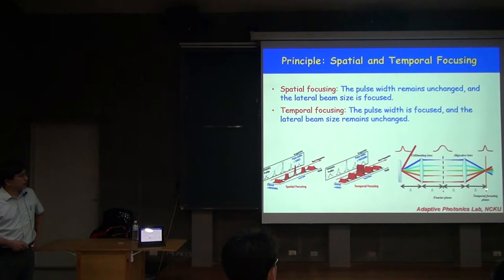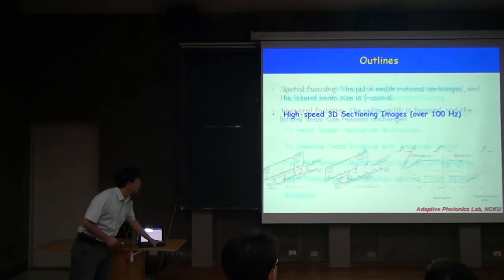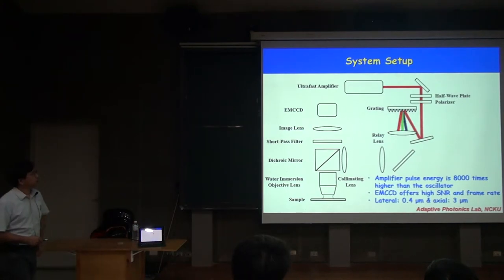So it means here you have a very high photon density. So it's possible to produce multiphoton absorption in the focal plane. So in the focal plane you can get the multiphoton excitation. Here the spot diameter is around a few hundred microns. So then you can catch the fluorescence image simultaneously in the focus spot. So this is our system.